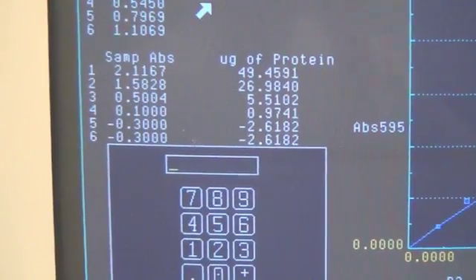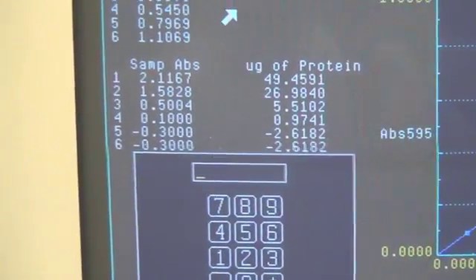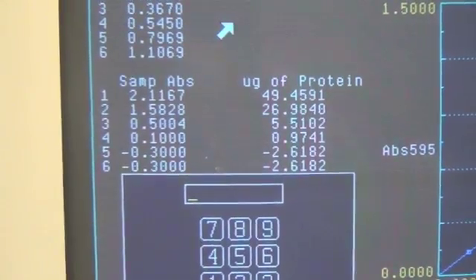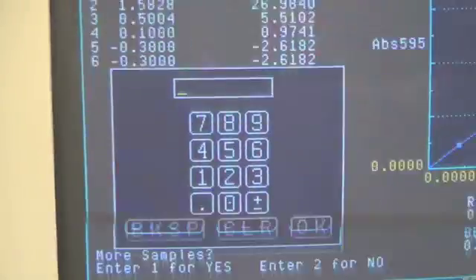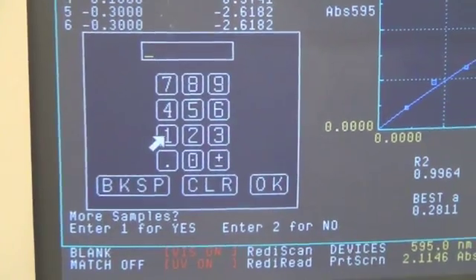The program will then ask you whether you'll be measuring another set using this high-tech computer keypad. Select one as you'll be measuring a second set.